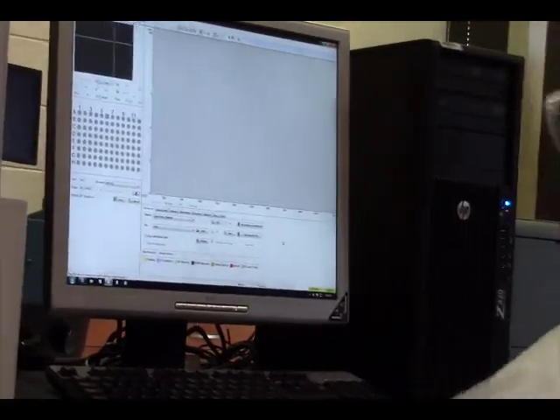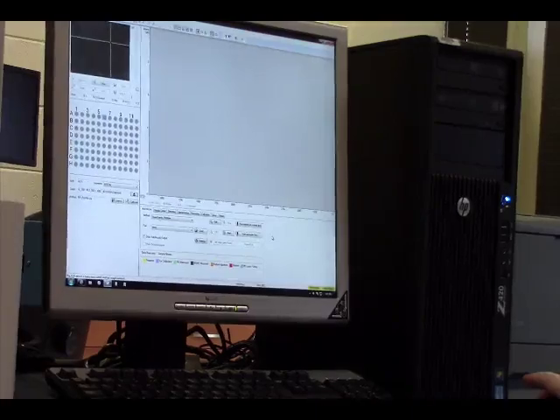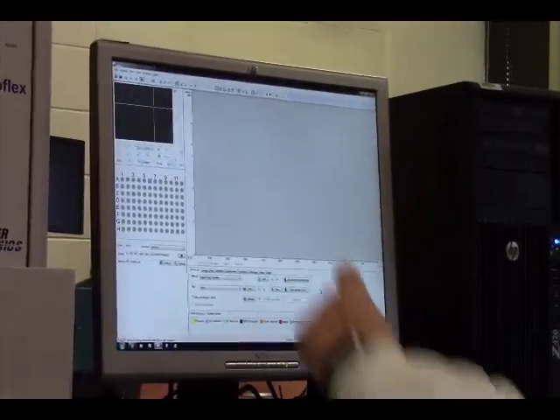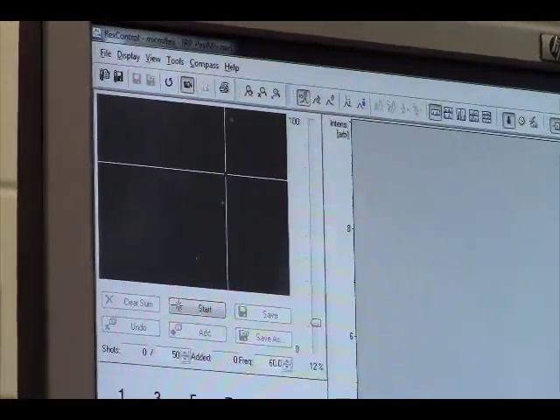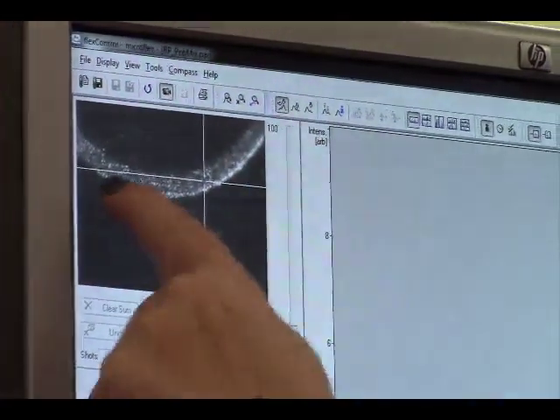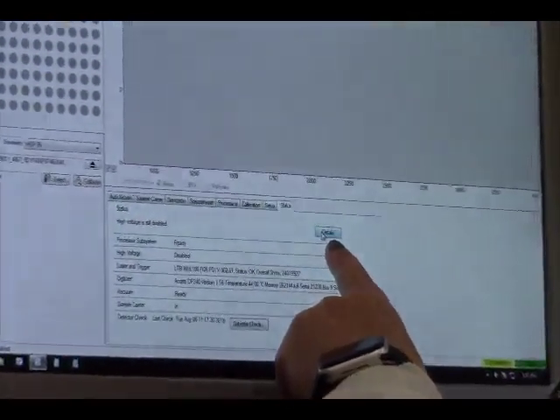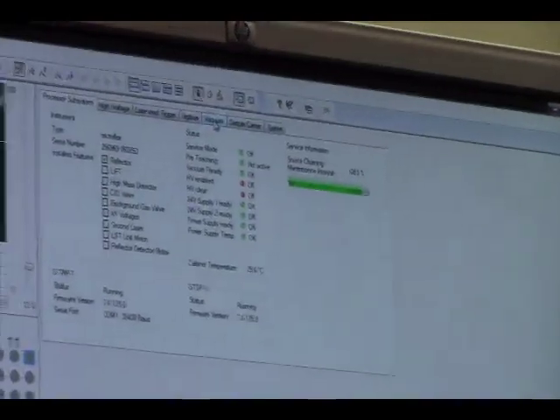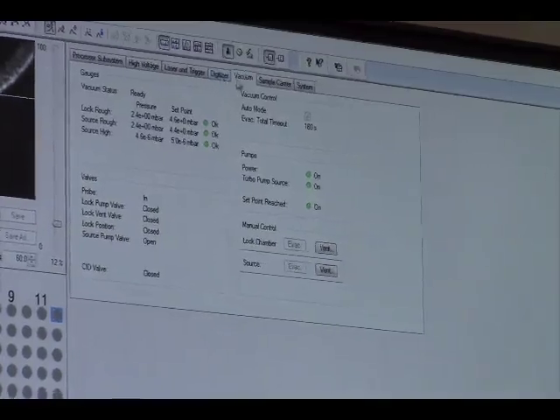You'll be able to point with your finger on the computer what you're going to push and stuff. Okay. Makes it a little bit easier so I can zoom in. Alright. So you can see that our plate is now pulled inside the instrument. This is an actual rim of one of those circles that you saw on the plate. What we're going to do now is go to status, details, and look at our vacuum. Our vacuum is already passed, so we should be good.